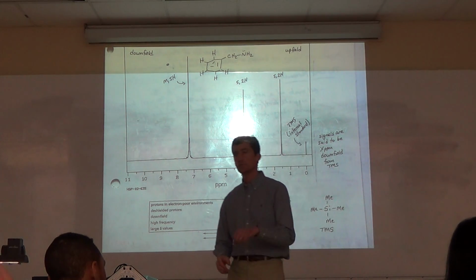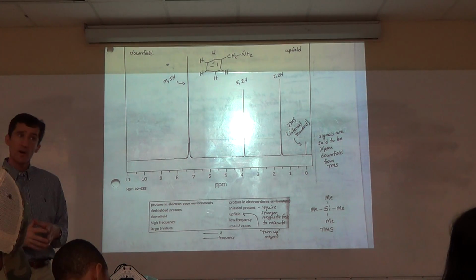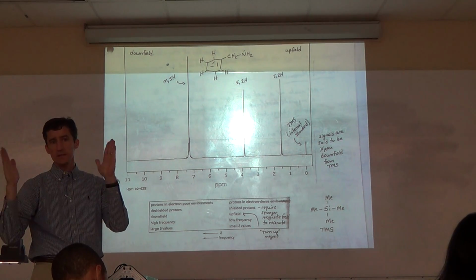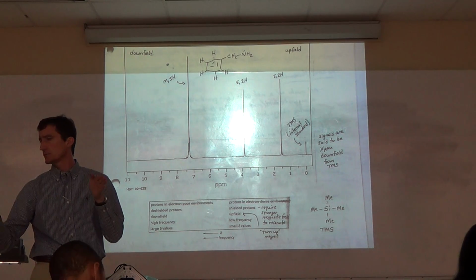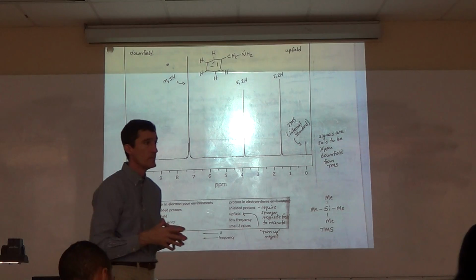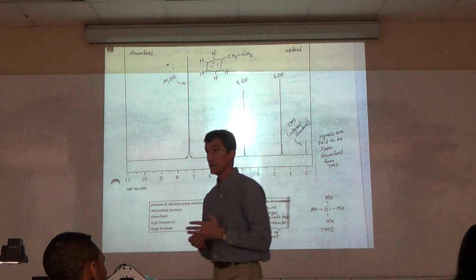Why do you have to use an internal standard? In IR, you don't have to do this. In IR, the spectrum is very uniformly generated, 4,000 to like 400 reciprocal centimeters. You have calibration for each test you run? In IR? I don't know for this. Yeah, but why?